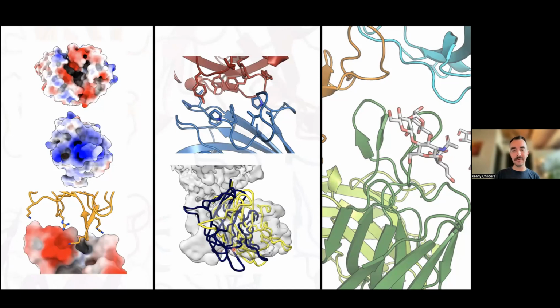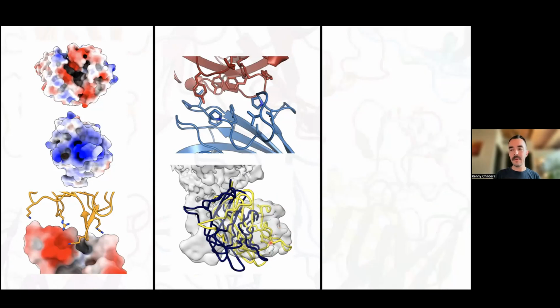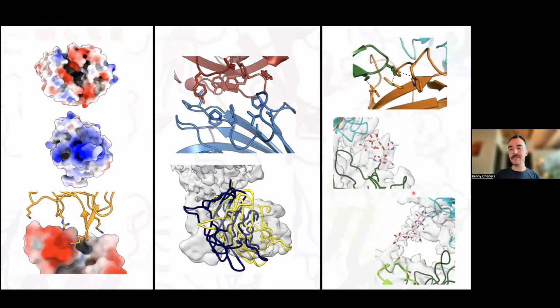And we were also able to further support this conformational rearrangement to the C2 domain. And lastly, we were able to characterize this anti-C1 domain inhibitor that uses a really novel glycan group. And due to the high quality of the map, we were able to model that in, as well as a number of other glycosylation sites on factor VIII. So that's really been the benefit of cryo-EM and how it's really helped our lab.